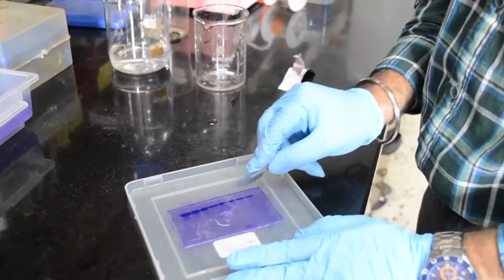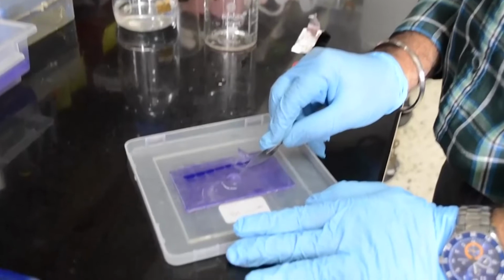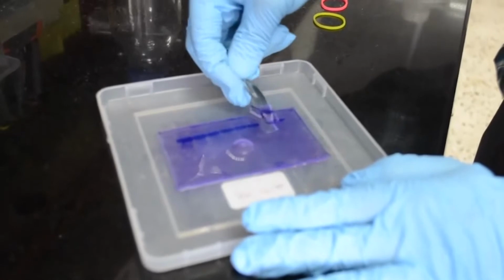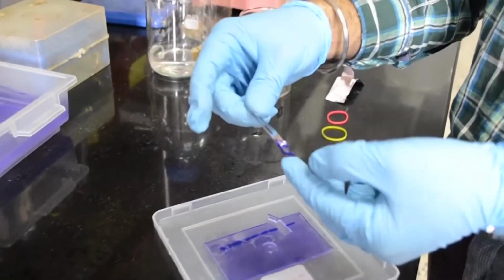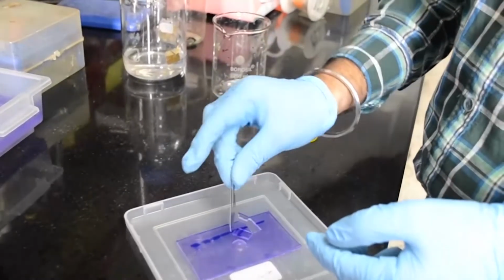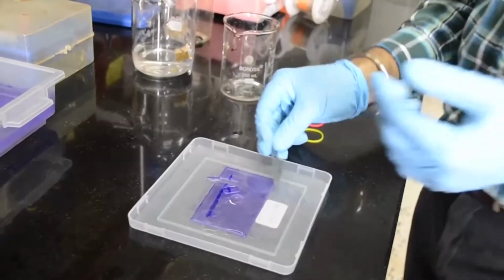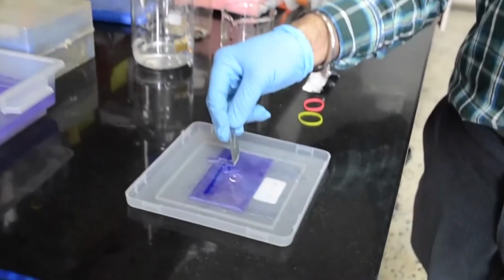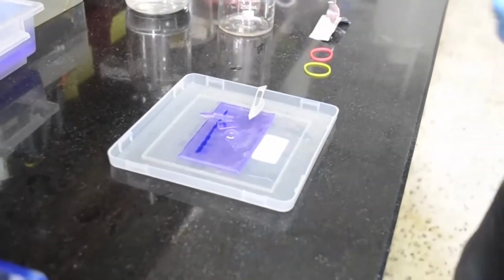like this, and then I can cut from the top and the bottom, and then you can remove this particular gel block, and that should be good enough for eluting this particular protein or antigen. If you are interested in isolating the protein at very large concentrations, then you can simply merge all these wells and run a very large quantity of the protein.